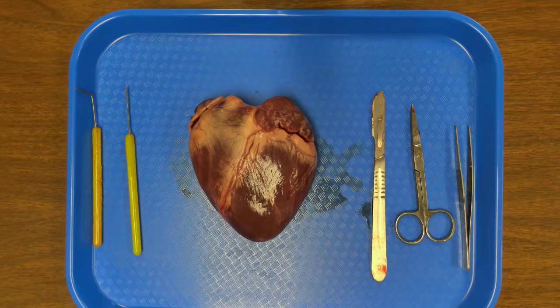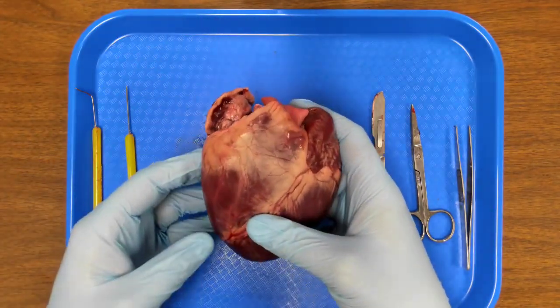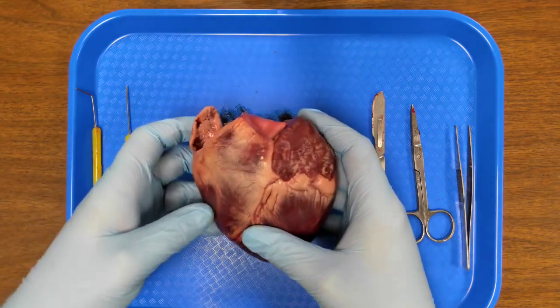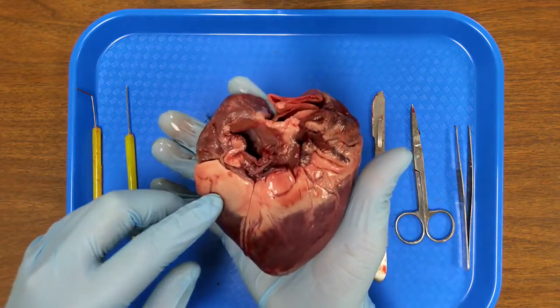Okay, so we've got our pig heart here, and like I said, you can see those blood vessels on the top have been cut off when they were removing the heart from the pig. If we're looking at the heart here, this is the front side of the heart. This is the back side of the heart.